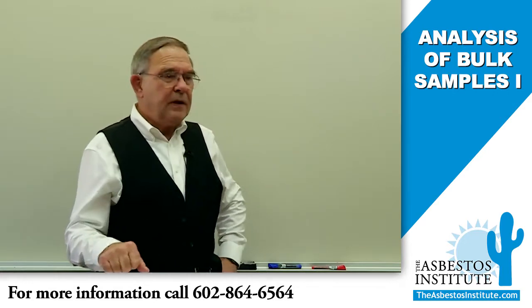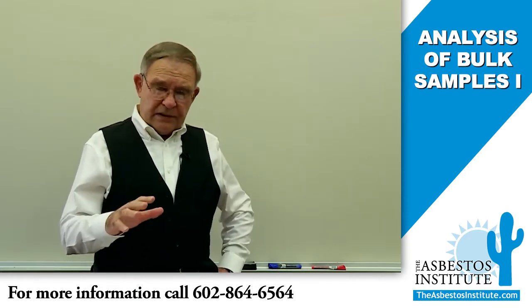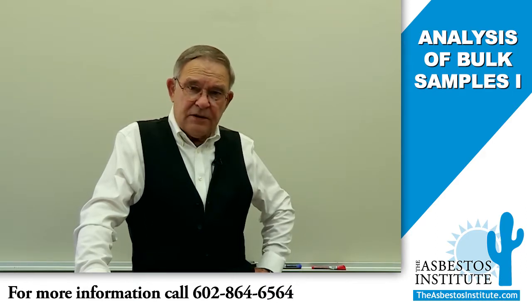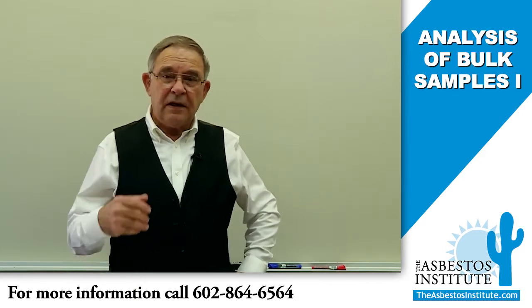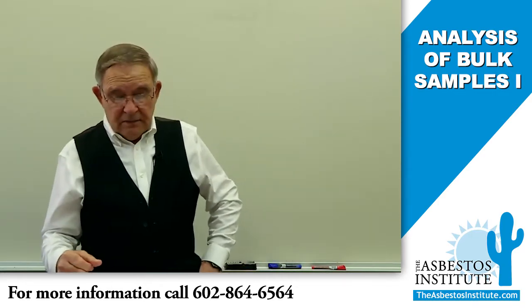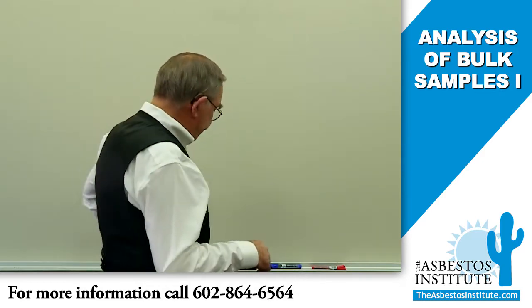Again, PLM is our basic method of analysis, but it's not the only analytical method that we have, and in fact, it may be the weakest of the analytical methods that we have. The other methods that we commonly use are TEM, transmission electron microscopy, and then variations of PLM and TEM like point counting and gravimetric reduction, and then analysis of residue by PLM or TEM. The various methods I'll mention in just a moment. First, I want to get back to why analysis is done.